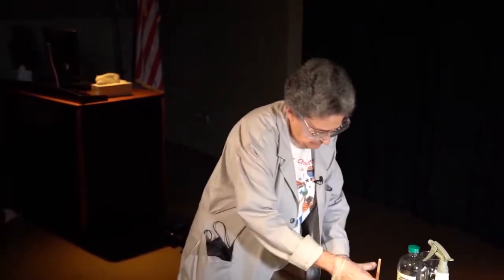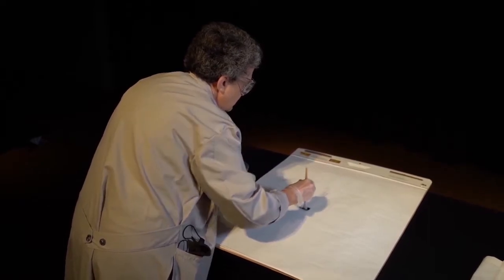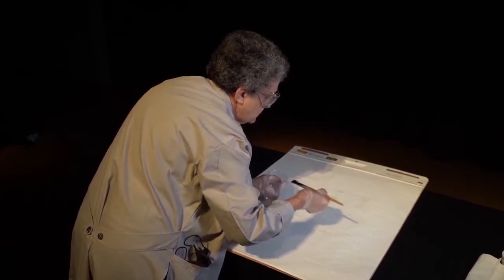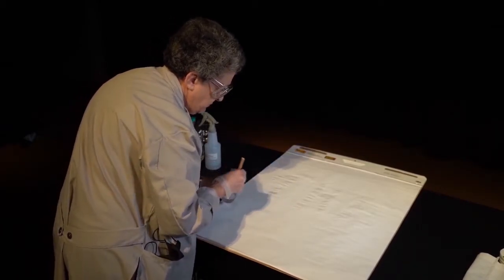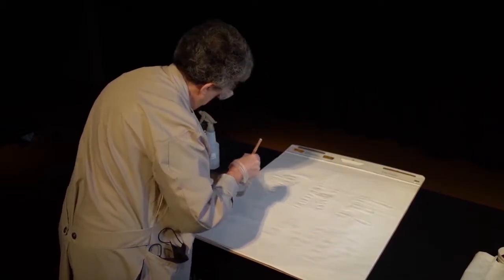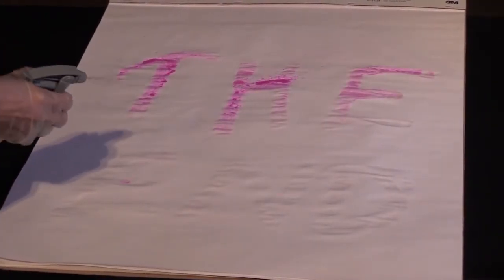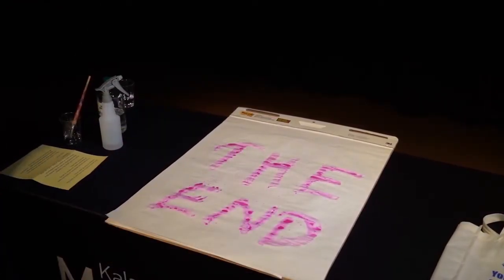Let's see what happens. See the nice pink color?